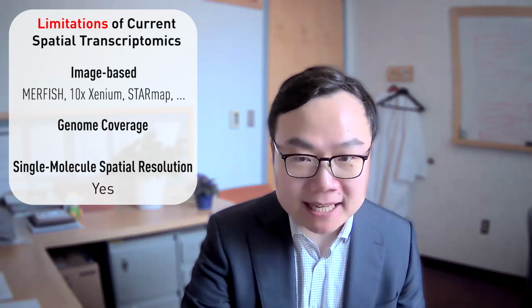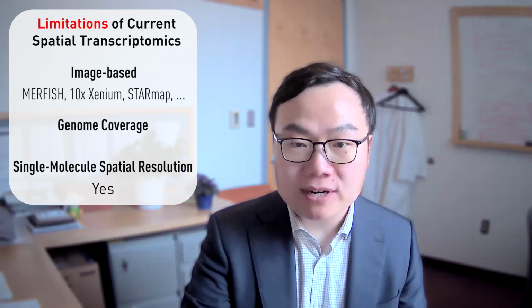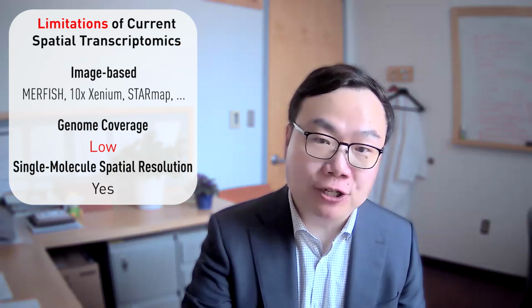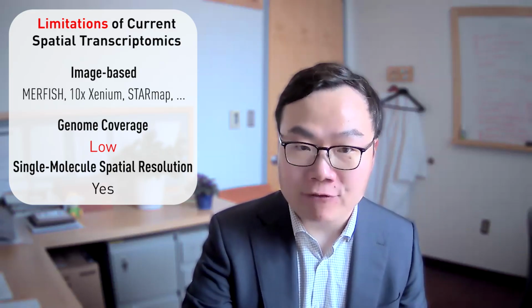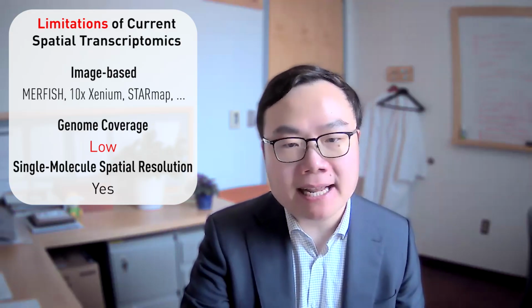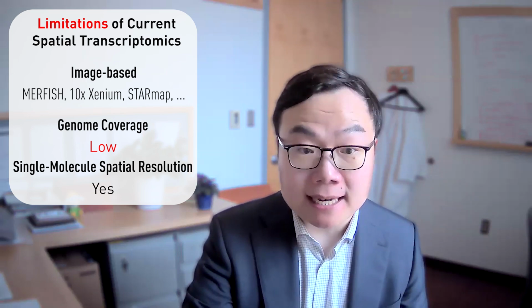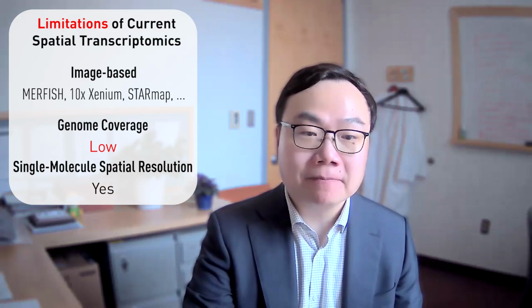Cell segmentation is precise and unambiguous, allowing fine-scale analysis, but they require researchers to pre-select a few hundreds to a couple of thousands transcript species of interest to target, and they don't have genome-wide coverage. Due to this limitation, image-based spatial transcriptomic studies sometimes only yield validations of prior knowledge rather than new insights due to the pre-selected RNA targets being well studied.